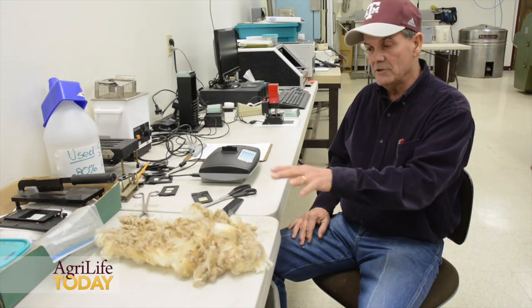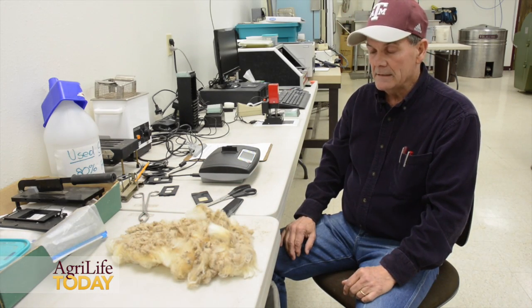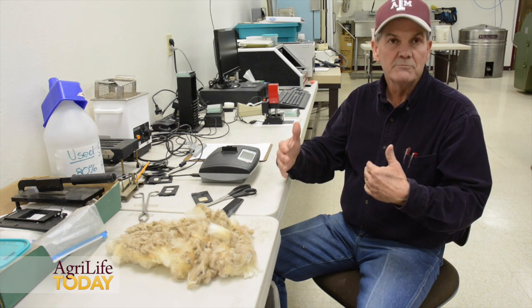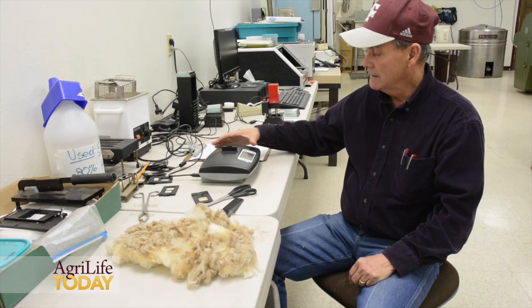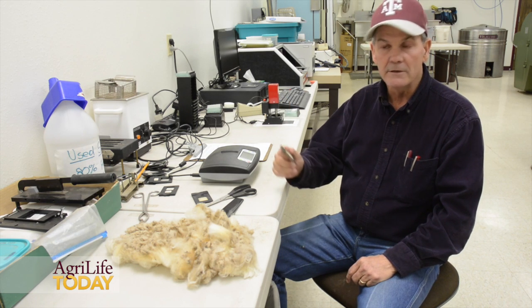The reason we use a side sample in the original sampling procedure is that it is representative — it better represents the overall average of the fleece. Once the sample is read, you can pull it out and run another one.